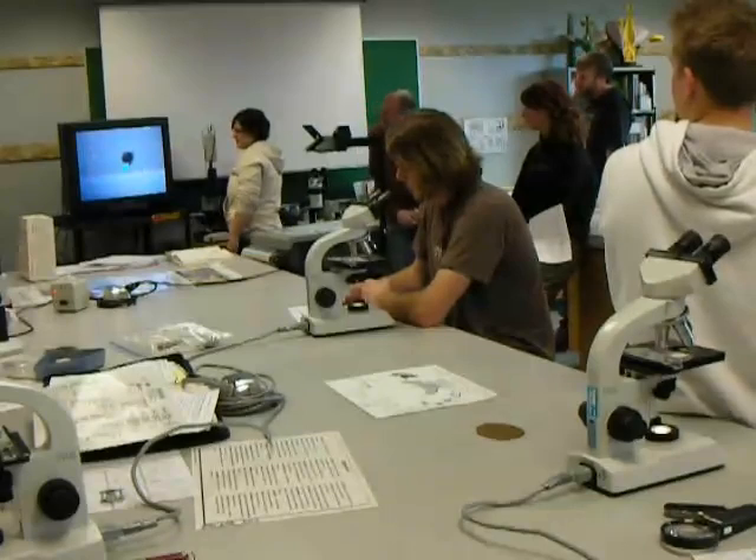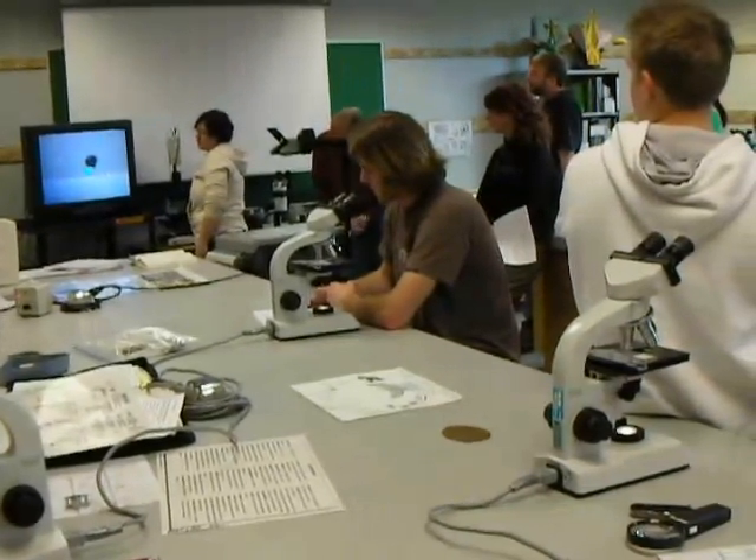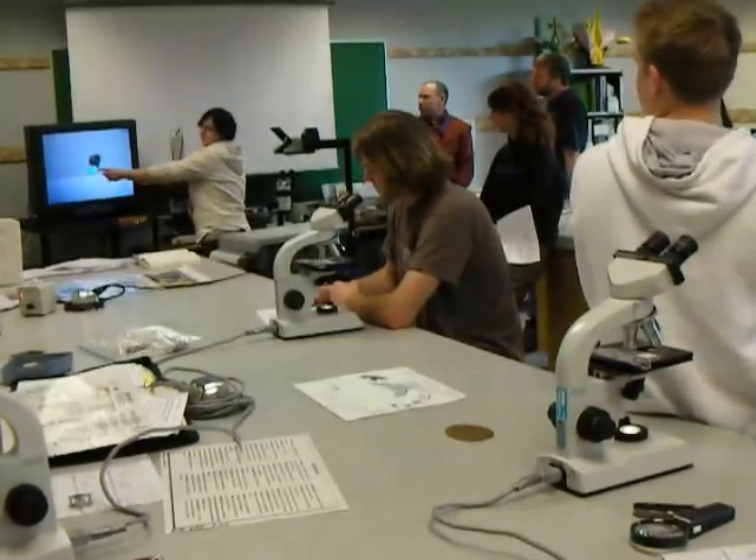It's known to use the fine focus. And it might take a fair amount there, but it'll come into focus. Okay, there it is, crushed now, and there's a little other goal.